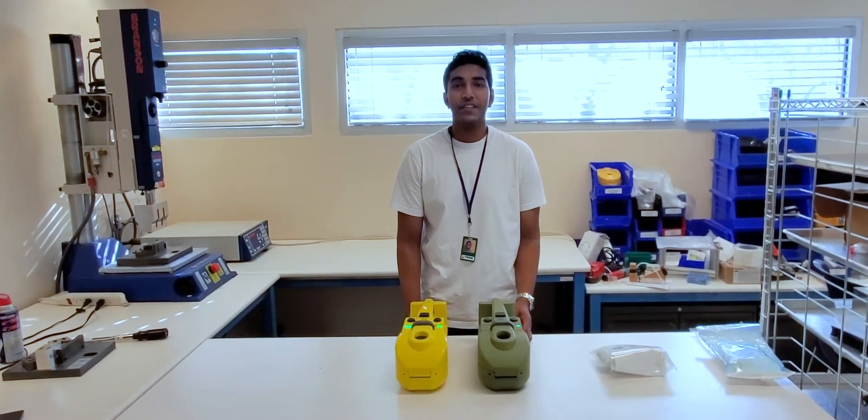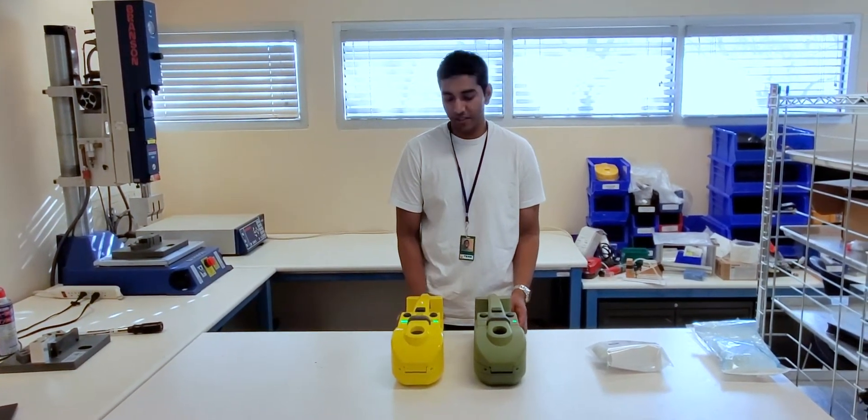Hi, my name is Akshay. I'm an intern here at BioFlight, and today I'll be demonstrating the Z750.